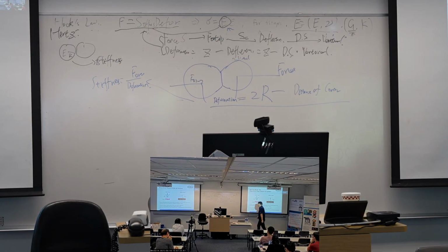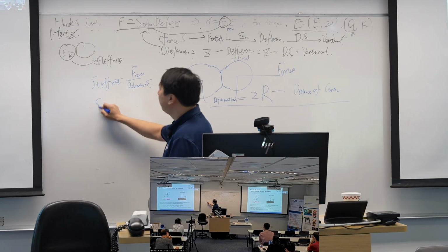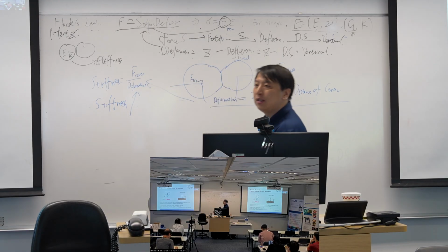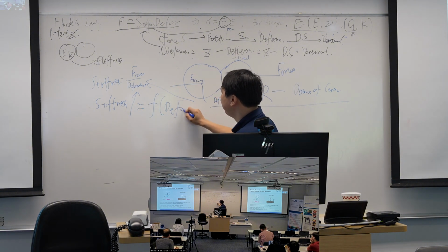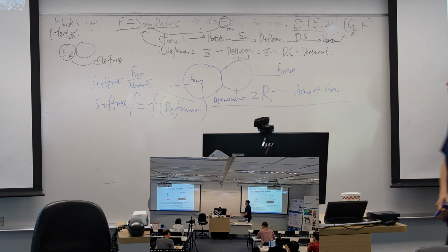That's Hertz's idea. So his idea is the stiffness will increase, and as such, it is a function of our deformation.